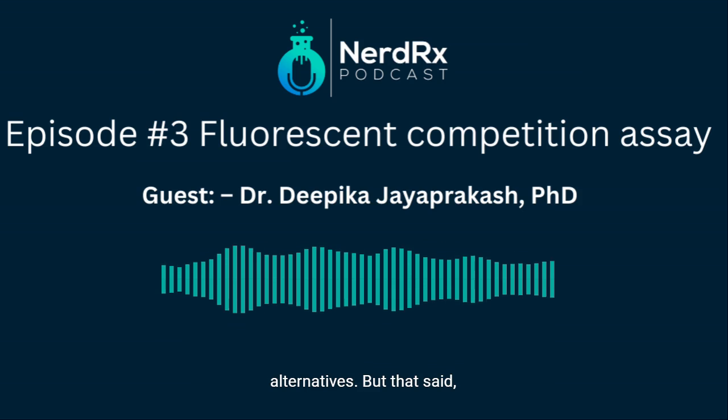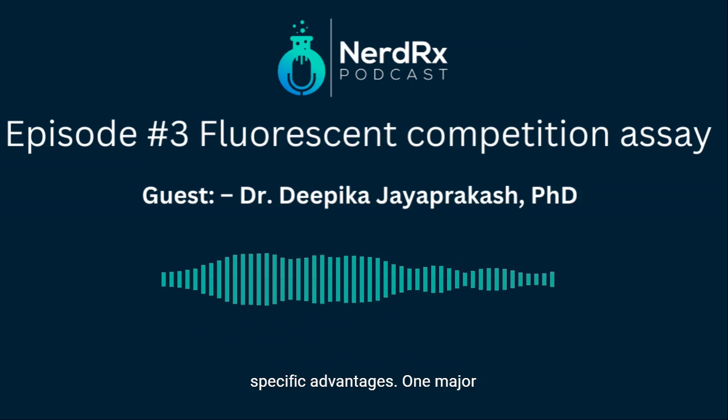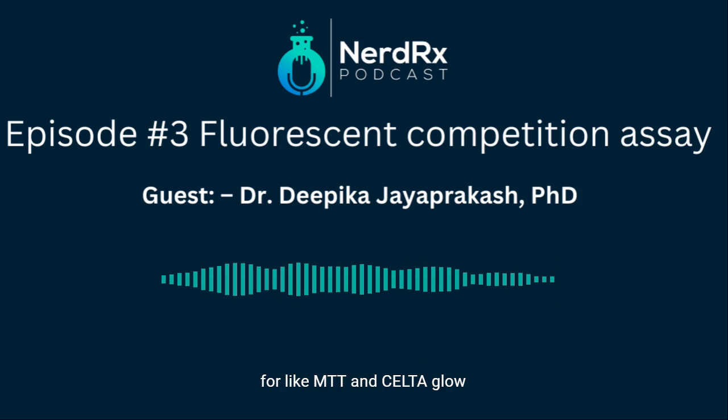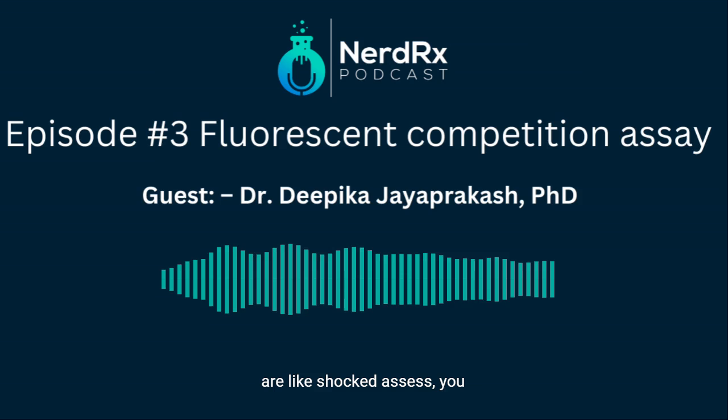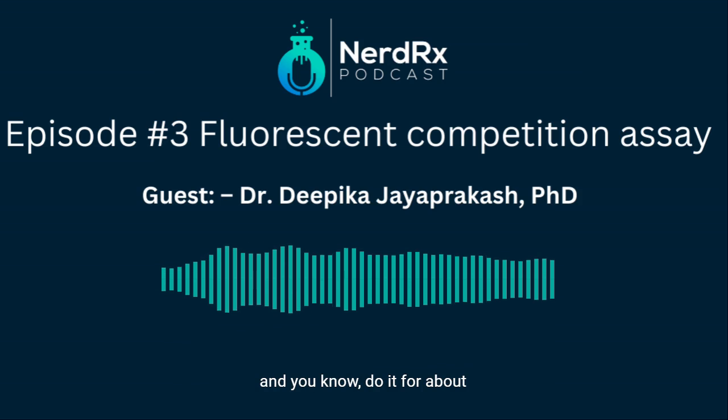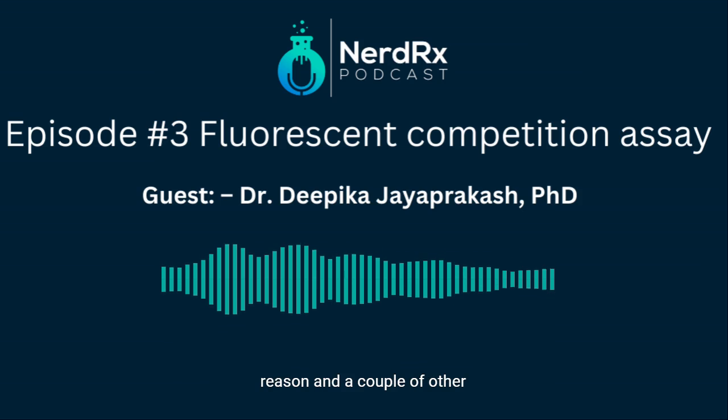But that said, the one that I'm using has specific advantages. One major reason is the time that I can use it for. MTT and CellTiter-Glo are short assays; you do them acutely. But since I wanted to reproduce the conditions of my screen and do it for about a month at least, I chose a GFP competition assay. That is one of the main reasons.